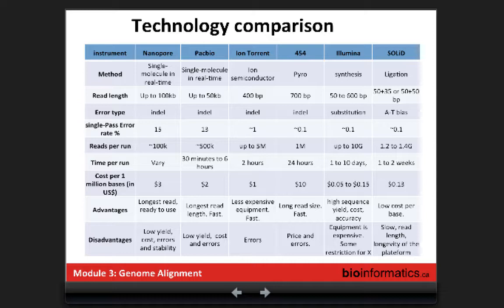So we have methods, like Jared talked about this morning. If we do 2D reads or two pass reads for nanopore, it will decrease the error to 3%. If you use the CCS approach for PacBio, you will also be able to decrease the level of error, but you will lose a bit on the maximum size of read you can have. So all these technical considerations, and as Jared said this morning, all these numbers are probably still out of date because the technology evolves really fast.